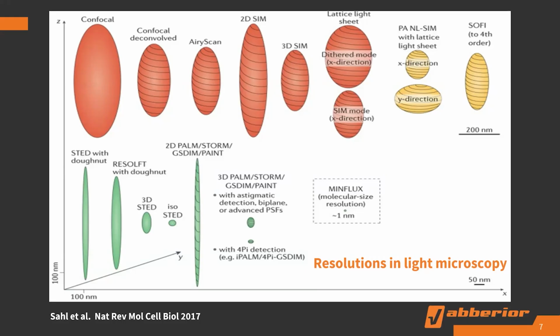However, the confocal method is purely optical. All the other methods in the upper panel with the stripes need mathematical calculation and post-processing to improve the resolution 2-fold over the confocal, like deconvolution, Airyscan, 2D SIM, 3D SIM, lattice light sheet, and so on. So in the lower panel, the scale bar is 50 nanometers. As I said, STED is a pure optical method. In our STED, we do not need any post-processing to generate a STED image. So this was demoed 2 days ago.